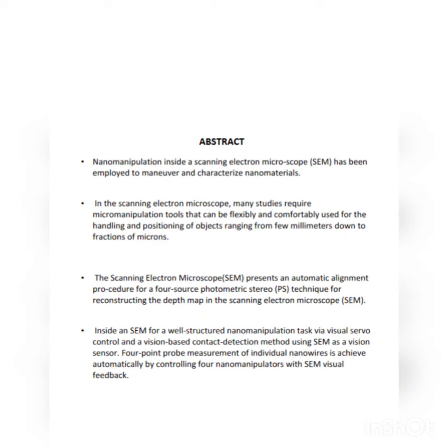The scanning electron microscope presents an automatic alignment procedure for a four source photometric stereo technique for reconstructing the depth map in the scanning electron microscope.